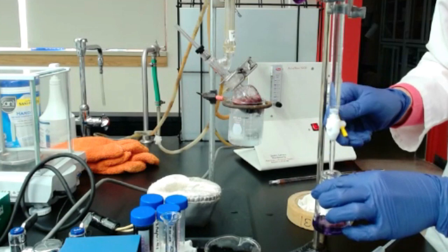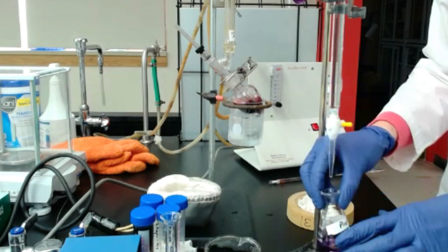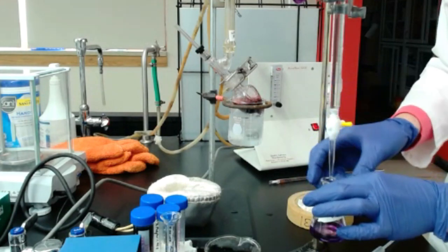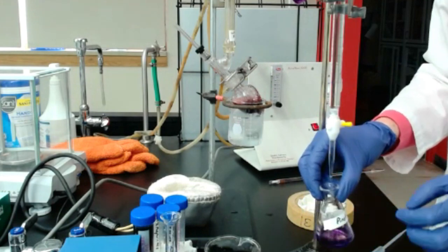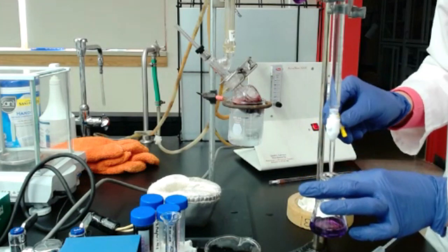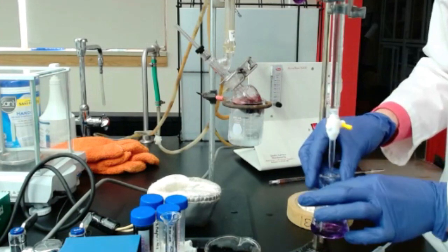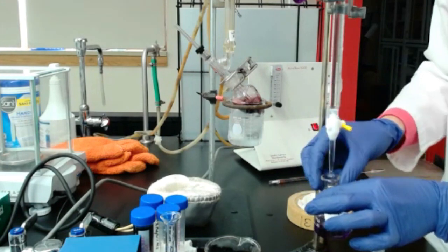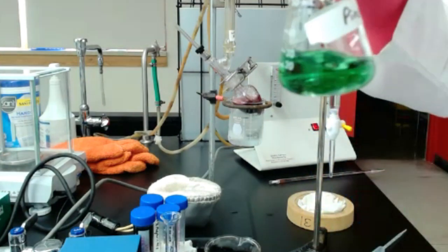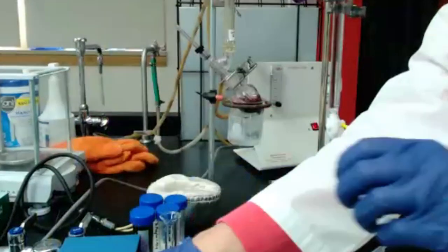So we are looking again at total SO2 of this Pinot Noir wine. And so I keep adding and stirring. If you have a stir plate, you could have it on a stir plate with a stir bar. If you don't, you can just do that by hand. All right, and it's taking a little bit more than the other wine. All right, and it's back to green. So same final color, but not exactly the same volume.